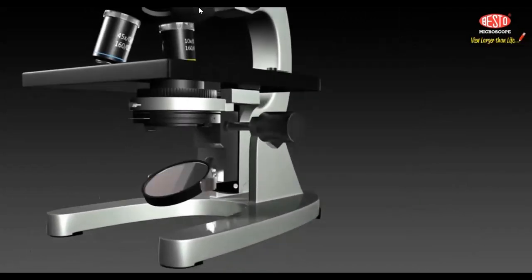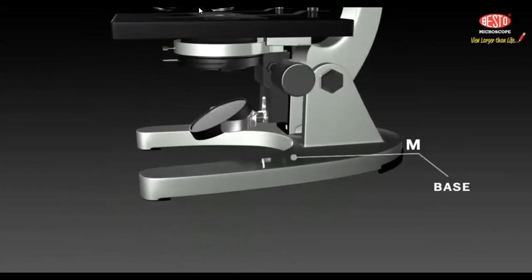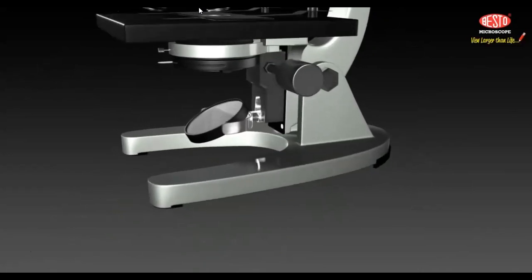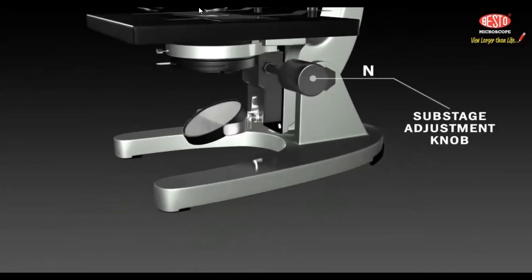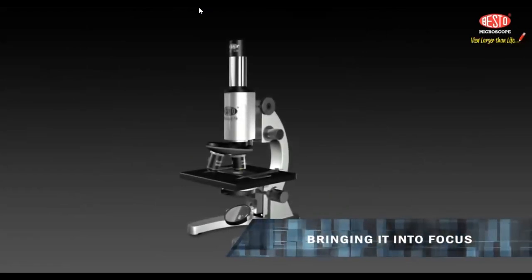L. The mirror, located beneath the stage diaphragm, increases the amount of light shining through your sample or slide. Sometimes we use a lamp plugged into an electrical outlet instead of a mirror or reflector. M. The base of the microscope is the heavy bottom part. It supports all the other parts of the microscope. N. The substage adjustment knob is used to move the condenser up and down, bringing it into focus.